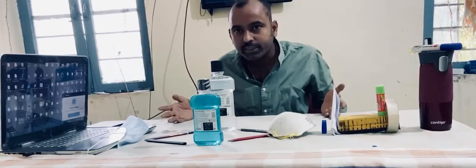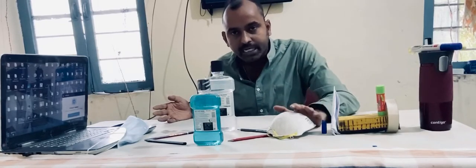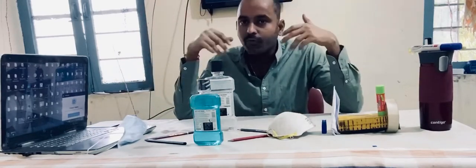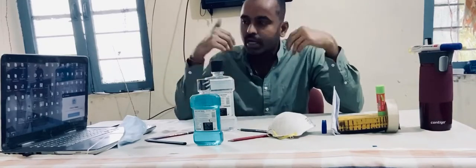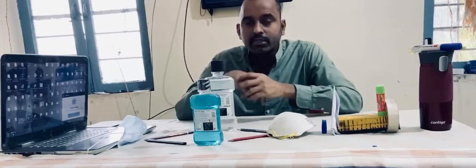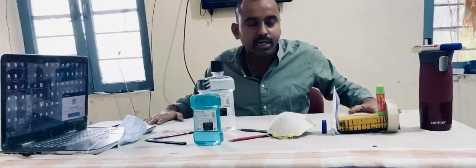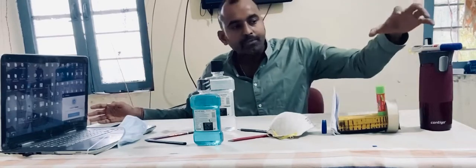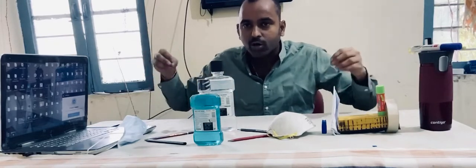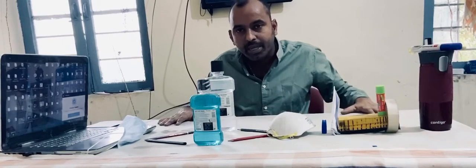If you come to fluorescence spectroscopy, you have one more additional part: one is your excitation filter and another is your emission filter. So this is the fundamental. For UV, nephelometry, turbidimetry, fluorescence and colorimetry, it is the same instrument, and every part is the same. The only thing is that sometimes you may change your source, and sometimes some additional components are added to the instrumentation. Apart from these, the complete spectroscopy is the same.